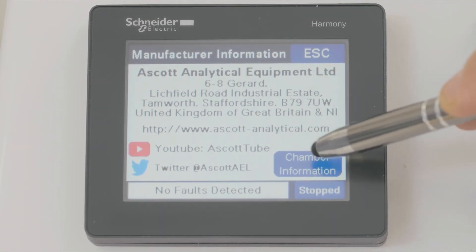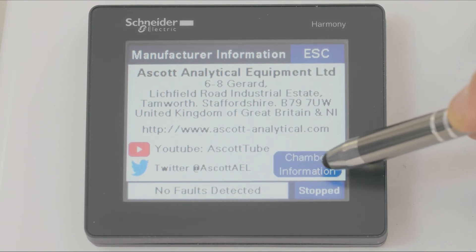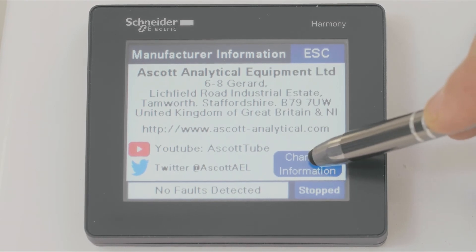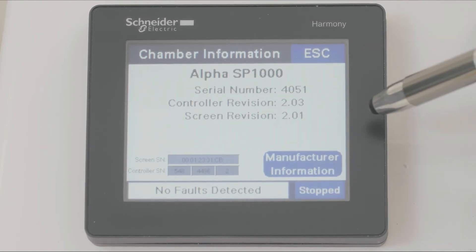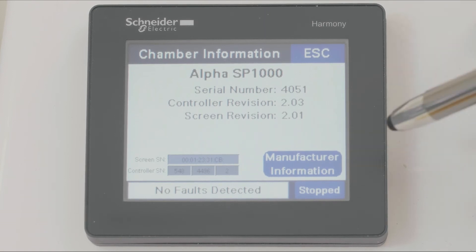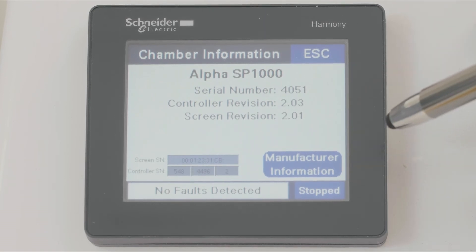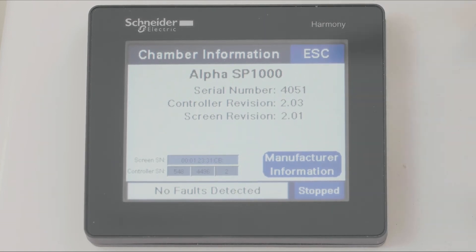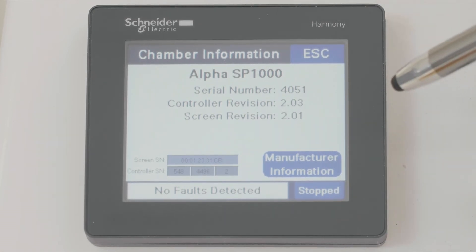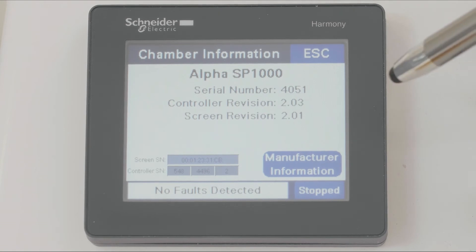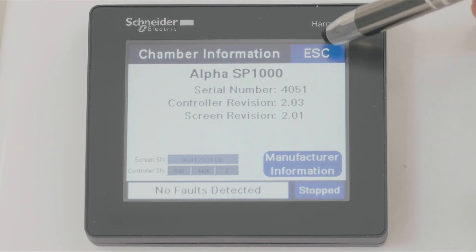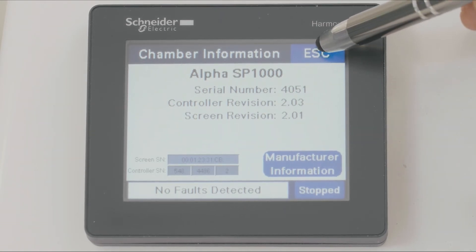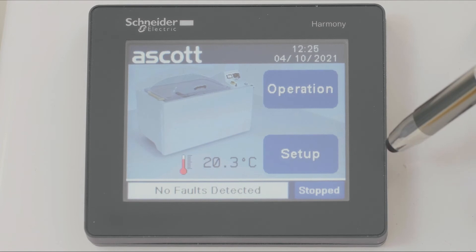And if we press the chamber information button, we find the chamber serial number and software revision numbers, which are useful if you have to contact your supplier about the equipment. If we press escape, we revert back.